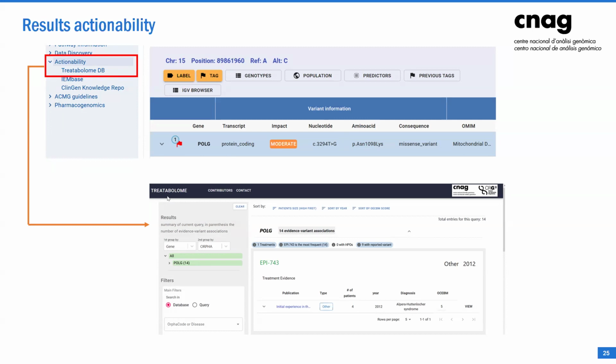This is mainly done because now many centers, which may not be experts in a specific disease, are doing exome sequencing and genome sequencing and diagnosing patients that they might not know about the treatment for. So it's really to try to give all the information at once.